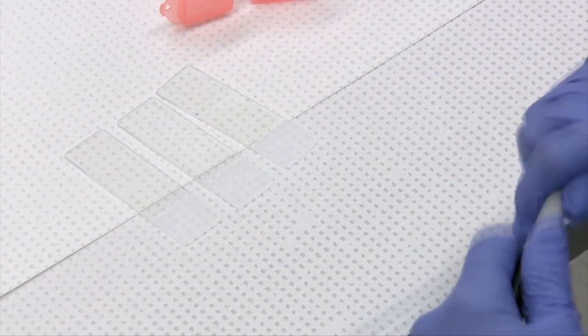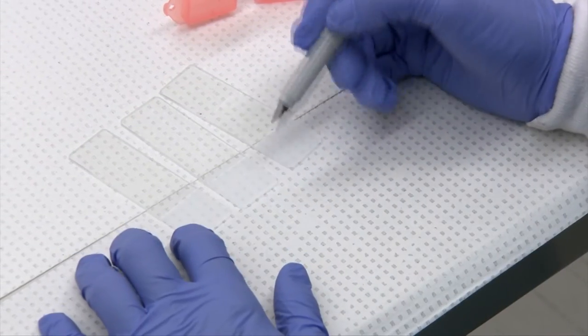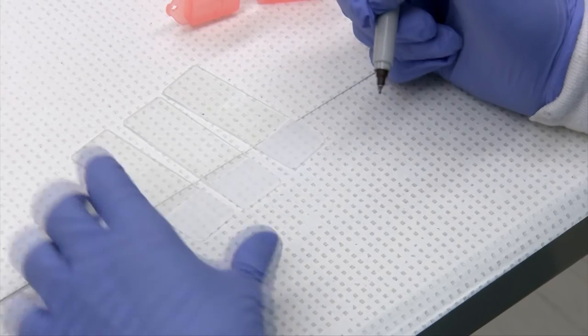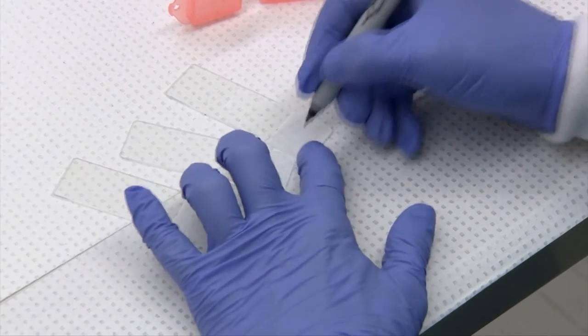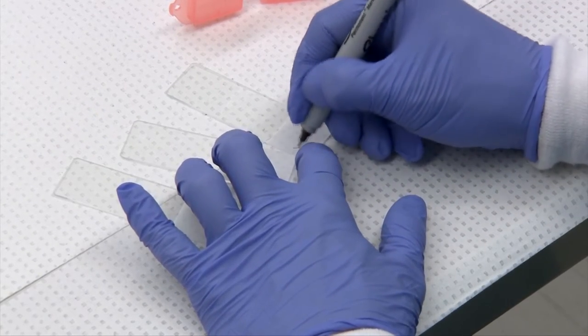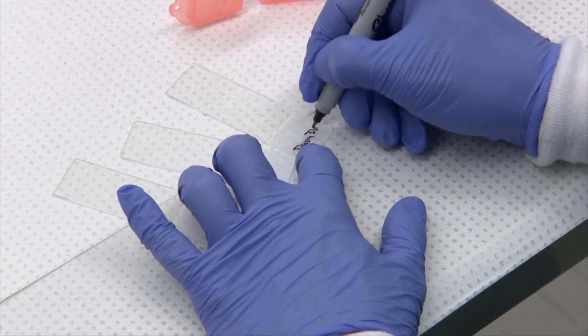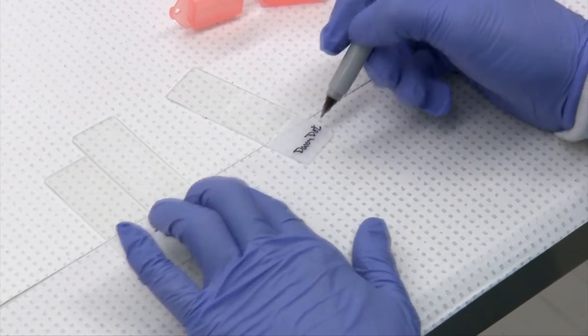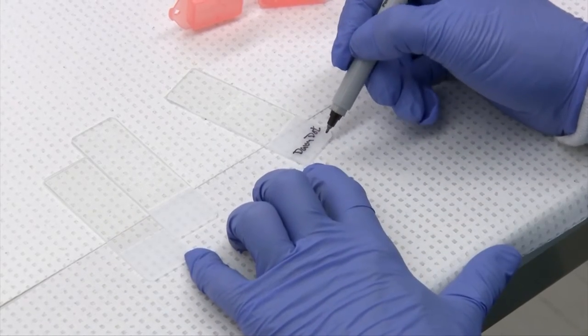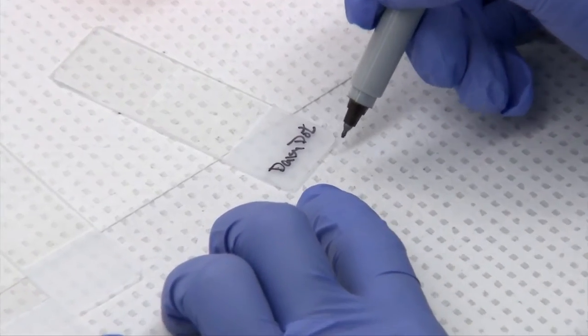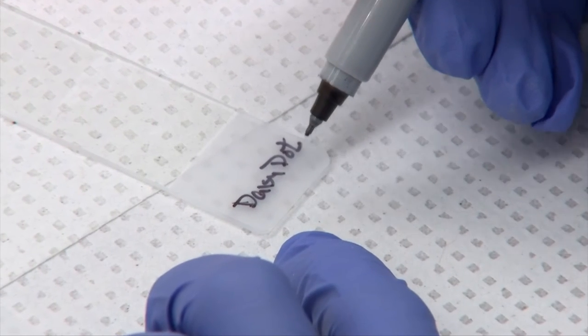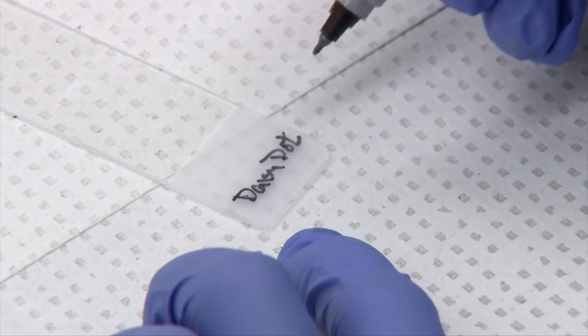Labeling your slides is important obviously. So you want to identify who your patient is. So say for example this was Daisy Dot. You want to label your slide very close to the bottom of the frosted edge. And the reason for that is you just don't want it being interfered with by the stain.